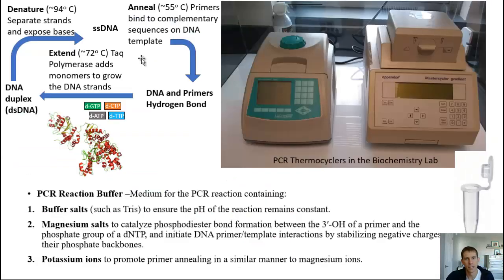So let's take a step back and look at this in lab. So in lab, this all seems a little bit overwhelming, but it's actually very simple as long as you have all the right starting materials. So we need our triphosphates. We definitely need our Taq polymerase enzyme, which is definitely sensitive, so we have to store that in the freezer. We don't have it out for very long. We don't do any thorough mixing. We essentially add about 1 microliter of our polymerase mixture into our vial over here. Once we add in everything else that we need, our DNA primers and our DNA sample.